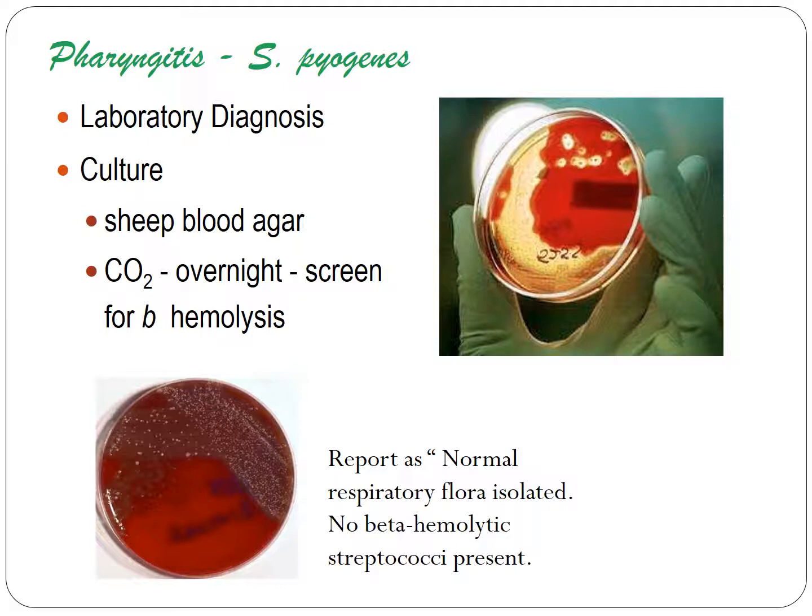Now observe the second throat culture shown here below. Do you see any beta hemolytic colonies? Because we're most interested in finding beta hemolytic group A streptococci on cultures taken from the throat to rule out or rule in the diagnosis of acute bacterial pharyngitis. When there is a beta hemolytic colony found, then we will identify that beta hemolytic colony.